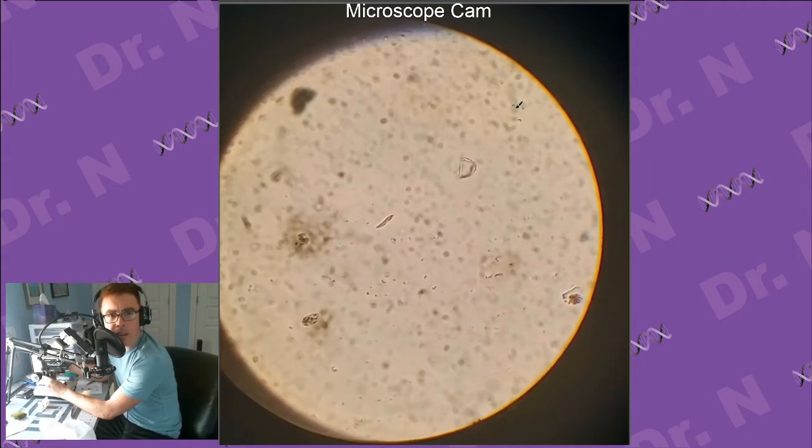Yeah, so he's swimming around looking for some prey. So they are predators. These guys are usually, I think, green because of what they eat. Because they're eating little cyanobacteria, so little photosynthetic bacteria. And usually they just stay green because of that. So he's moving around. I'll stop moving for a second so you can watch him swim very slowly. So they don't go by amoeboid movement, right? They're not moving their cell around. Instead, they have little swimmers, like little tails that move them around in a medium.